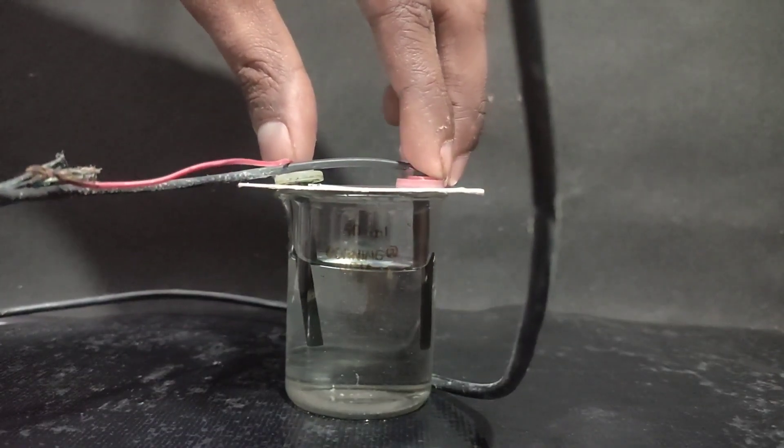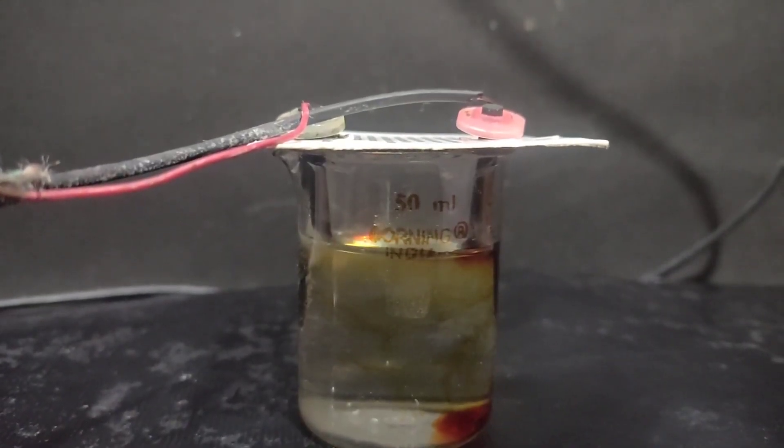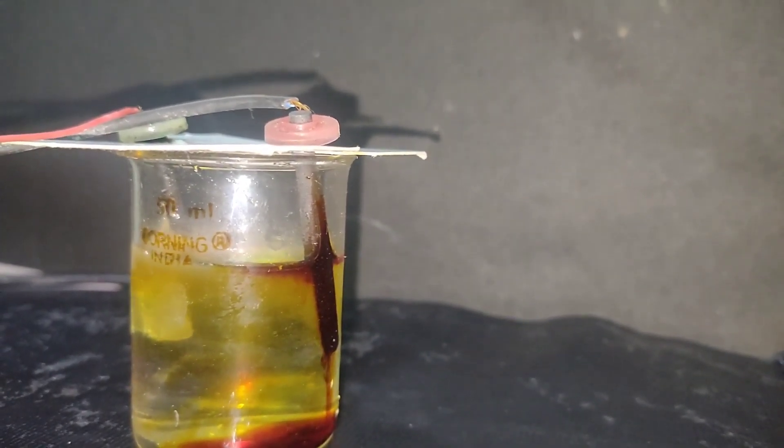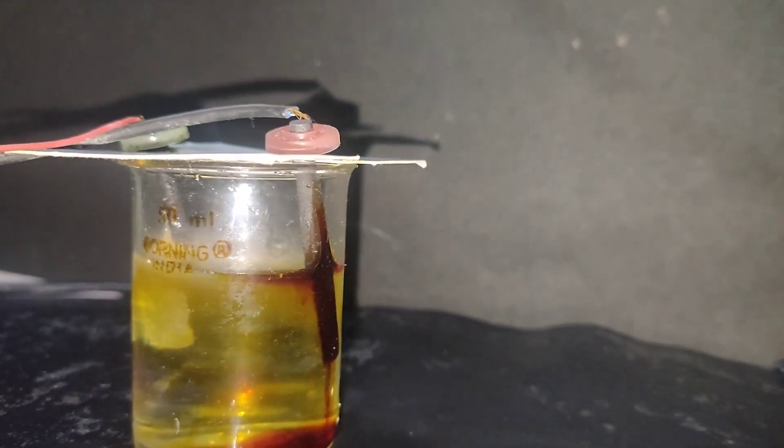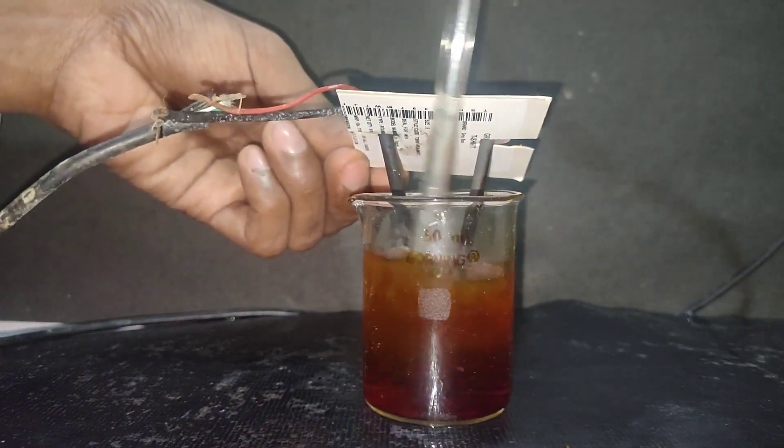Then I placed two graphite electrodes over it and switched on the current. On the cathode, which is the left, hydrogen gas is evolved and on the right, a brown stream is formed. I stirred the solution with a glass rod occasionally after short time intervals.